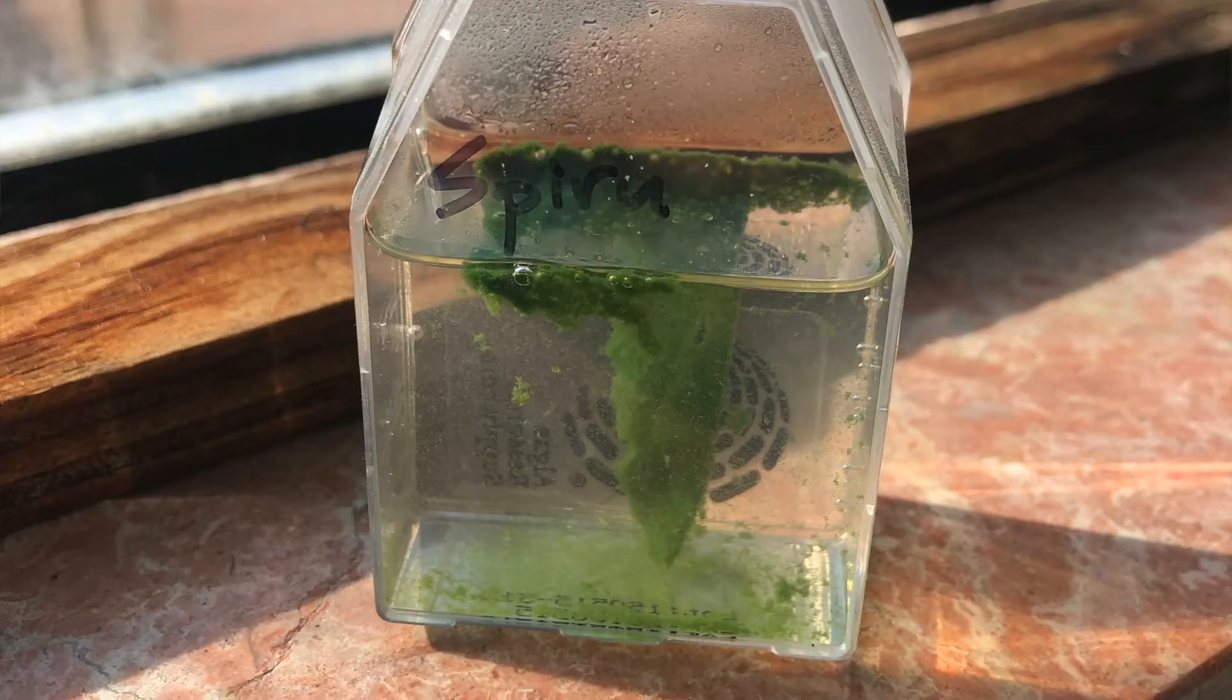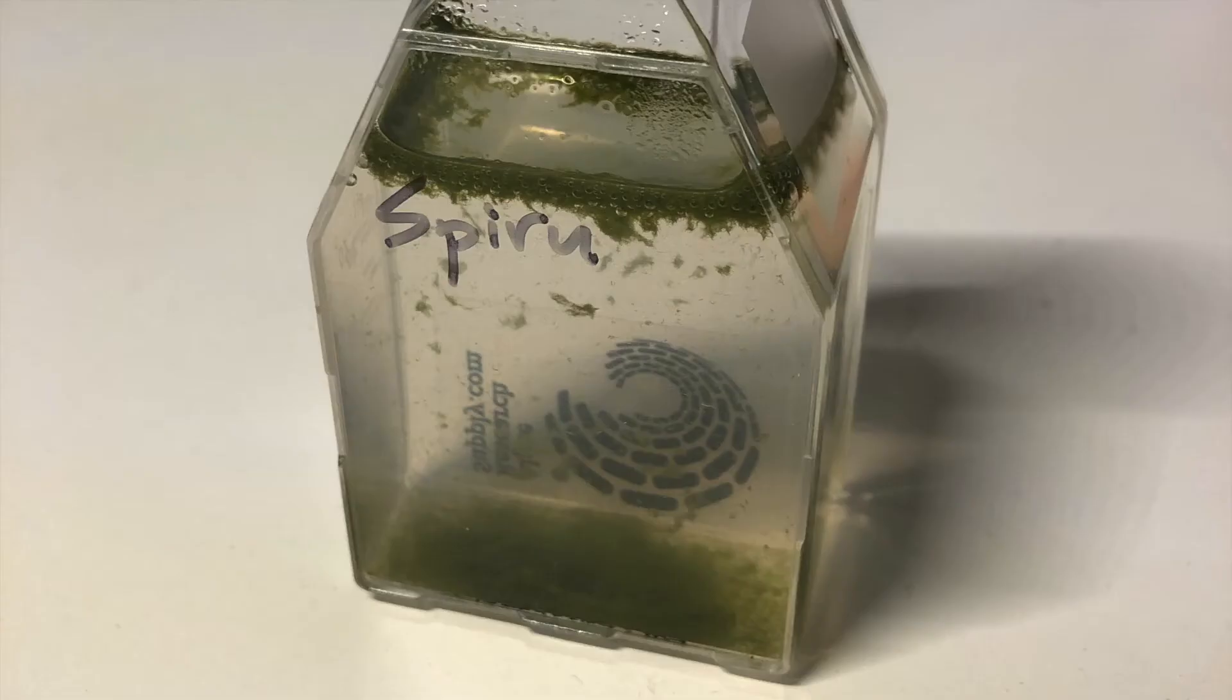Here's a photo of the spirulina 16 days after transfer when I think it was looking the best. And then here's a photo of the spirulina 21 days after transfer when it started to decline. The algae started to clump, some discoloration. I believe I shocked it with too much light.